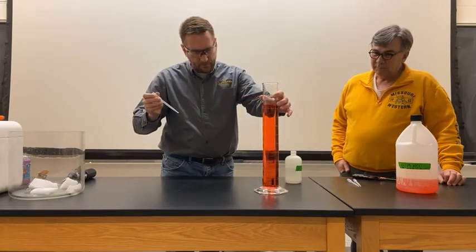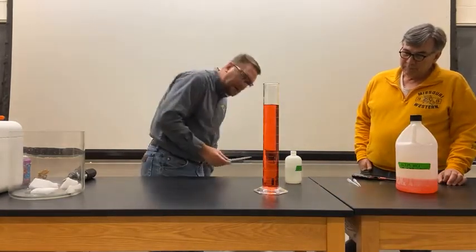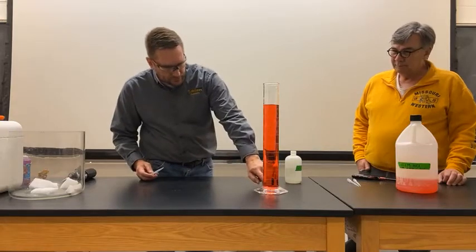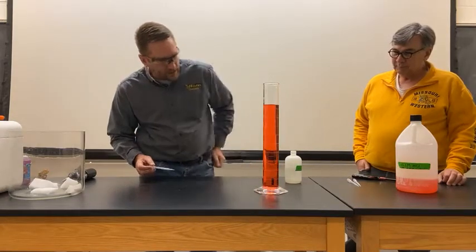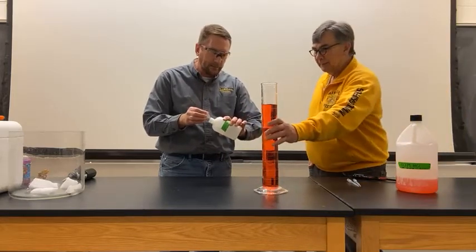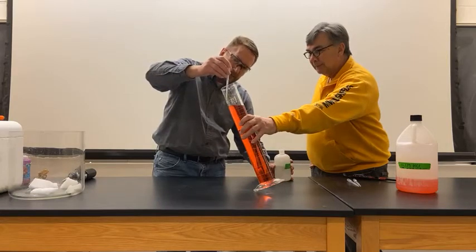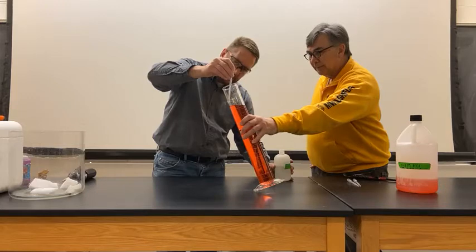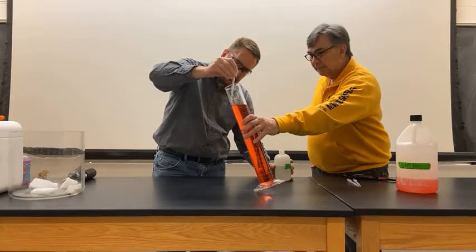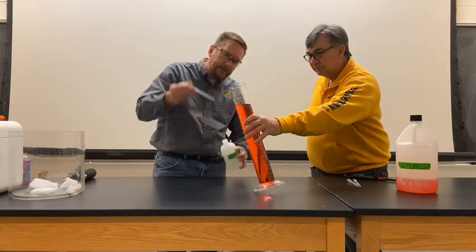Okay? So now you really can't tell that it's gone down to the bottom because I didn't put much in there. But what we're going to do is start to see some color changes occur inside of my cylinder. We want to be real careful not to mix it too much because we want that sodium carbonate to stay down at the bottom and start to make those color changes. So we're going to do this.